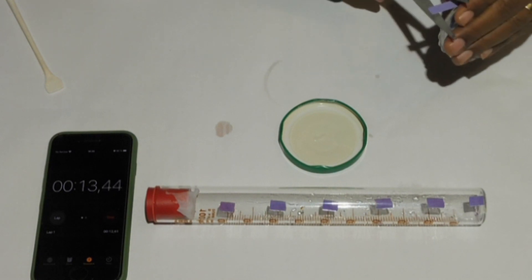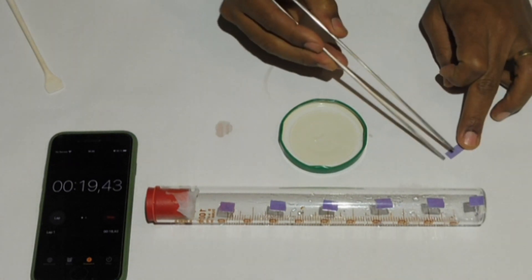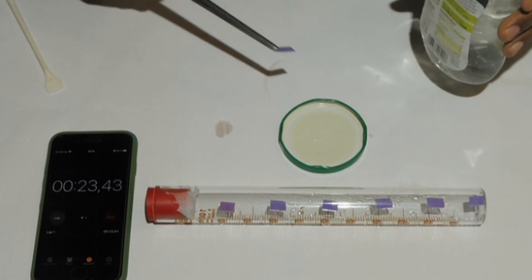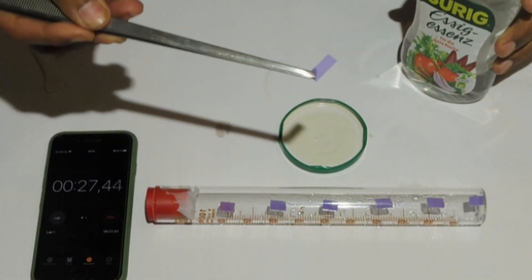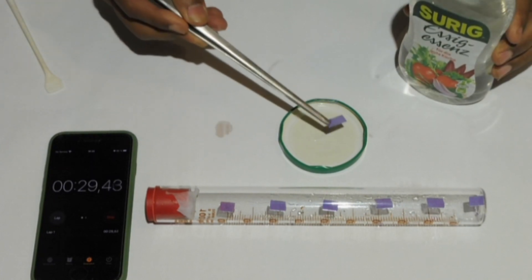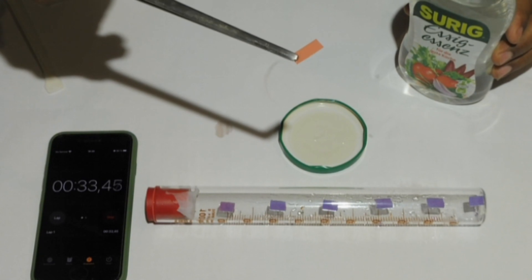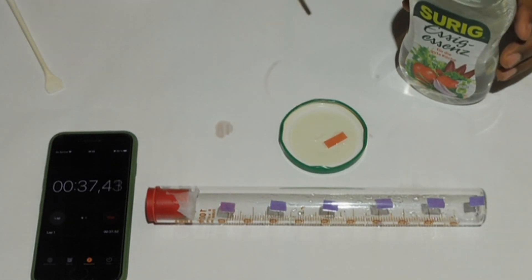While the time is counting, I will demonstrate what observation I am expecting from the litmus paper. I will take a small piece of blue litmus paper and dip it into vinegar. As you can see, the blue litmus paper changed to red when in contact with an acid. This is one way for testing acids.